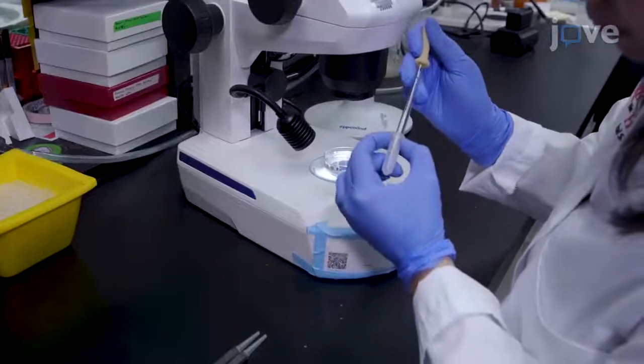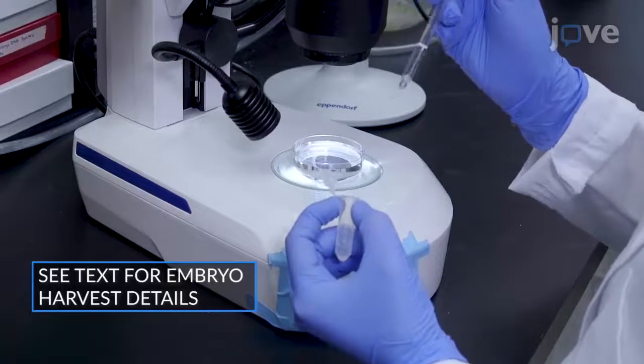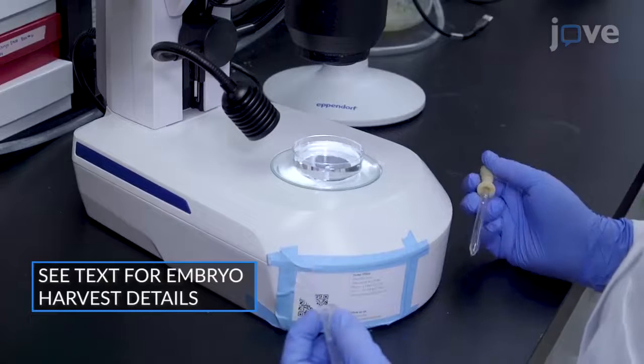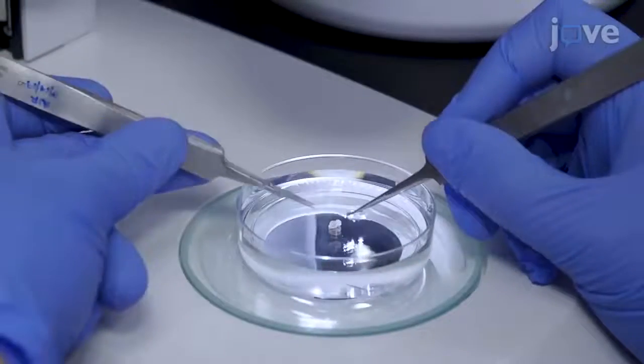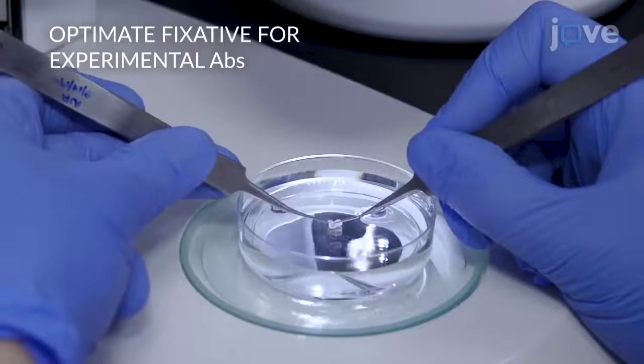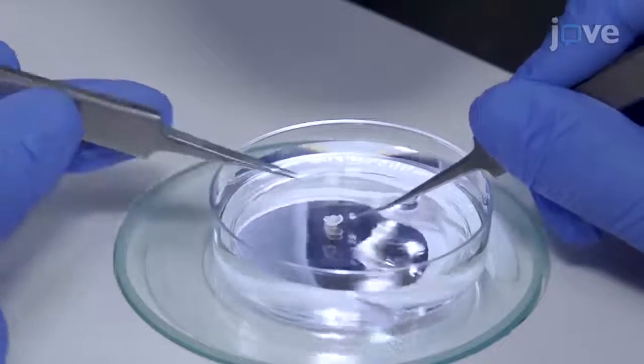Begin by using a glass pipette to transfer each mouse embryonic day 9.5 or 10.5 embryo into individual 2 milliliter tubes containing 1 milliliter of PBS. After fixation, use fine forceps to carefully pinch the embryo just above the hind limb and make a transverse cut to remove the posterior half of the embryo.